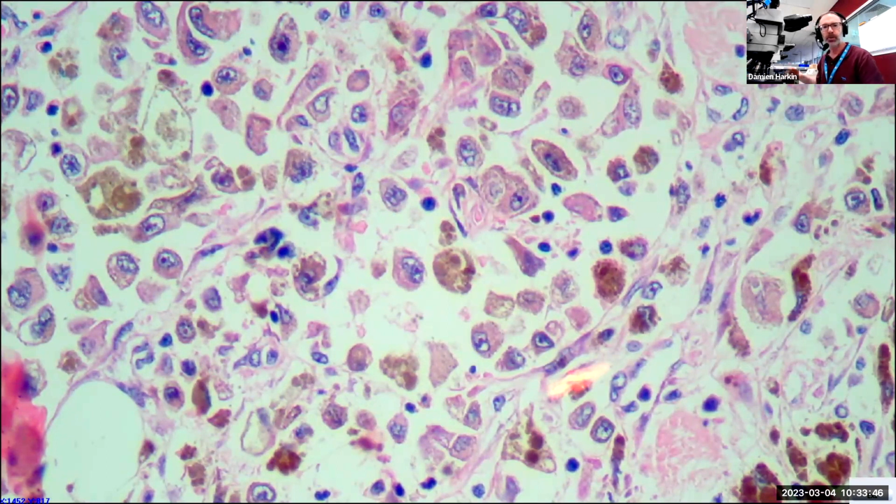Okay, and just to end on, as I mentioned, there are alternatives to using a bleaching step when it comes to melanin. There are also chemical reactions that you can use to color the melanin. And so we'll just now refer to this slide.